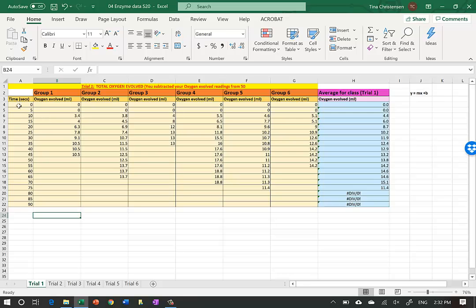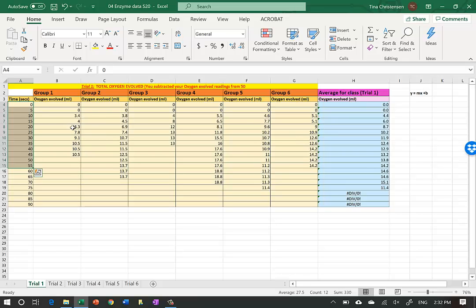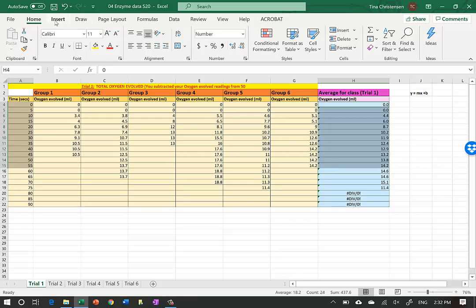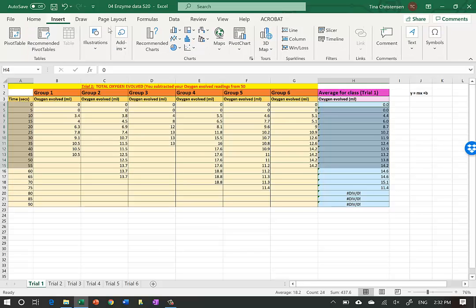We're going to do the first 55 seconds, so I'm going to highlight down to 55 seconds. That's on row 15, so it goes from row 4 to 15. Then I skip all the individual group data and look at the class data over at the very right. To highlight that I need to press down the Ctrl key and highlight down to row 15.